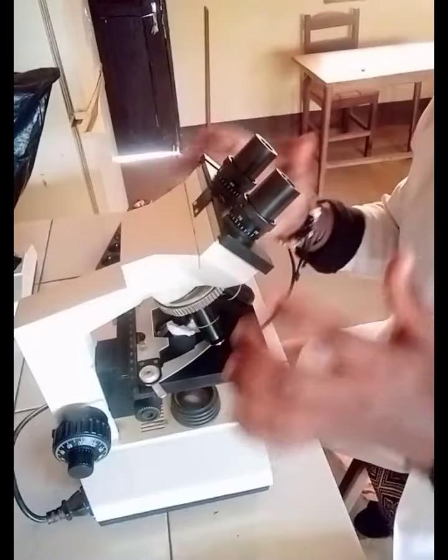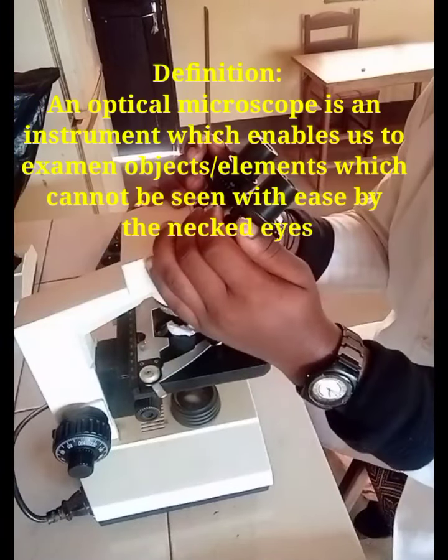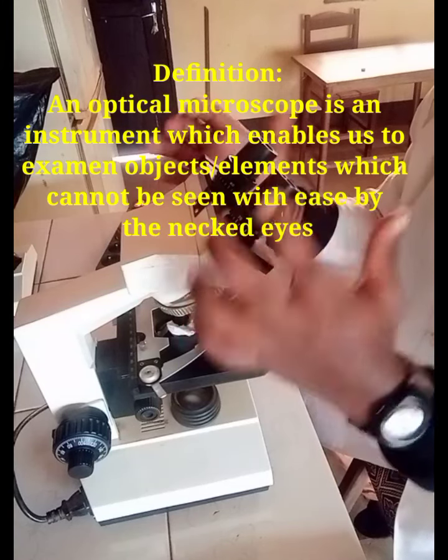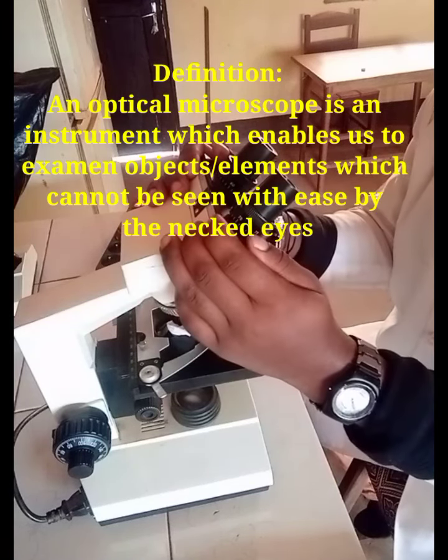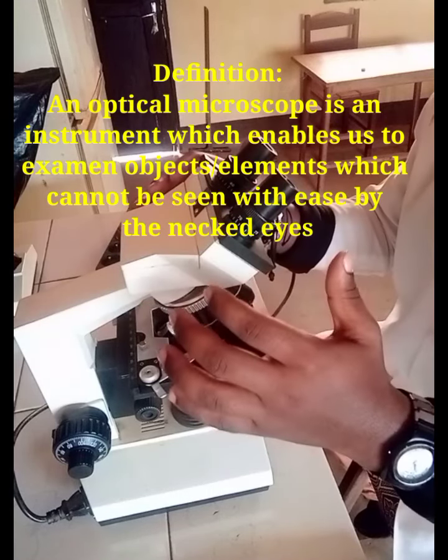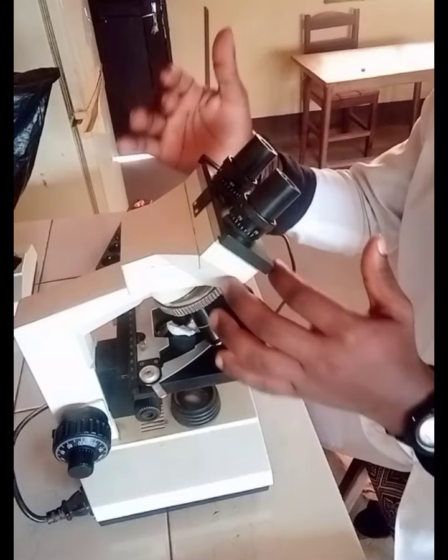So we shall begin with first things first. This is an optical electric microscope. It is actually called a binocular optical electric microscope. And now, this is how I always do to memorize the parts. I begin with the first things first.